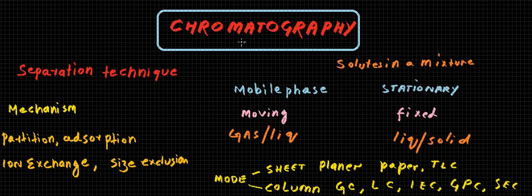So chromatography is a separation technique where a solute or components in a mixture get separated from each other by means of their interaction with a solid phase, stationary phase, or a mobile phase.